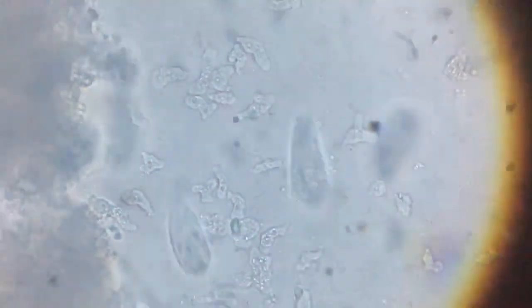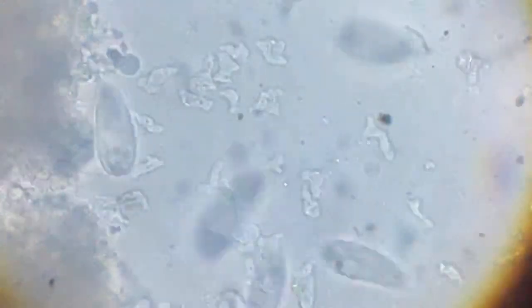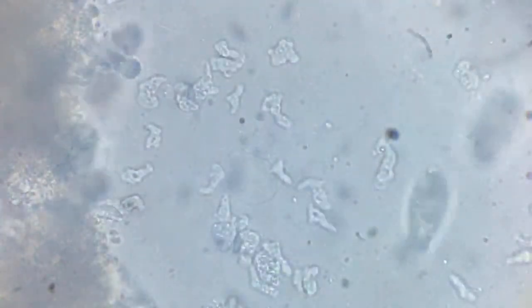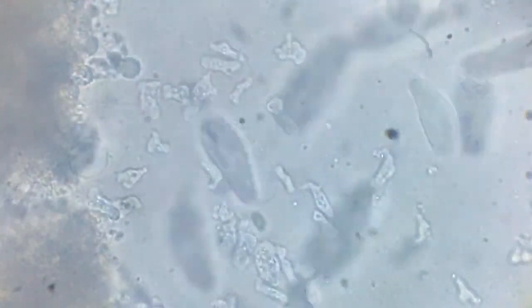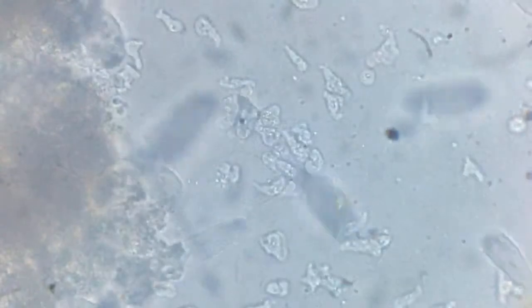what we have here is something fascinating. A lot of protozoans are marching towards this dead, decaying larva. You see those bacteria, you see them? You see that whole chunk or background of amoeba. Lots and lots of amoeba all moving towards this decaying detritus of a larva. And fascinatingly, they are all getting a kind of signal. They are getting some signal from this dead, decaying matter.